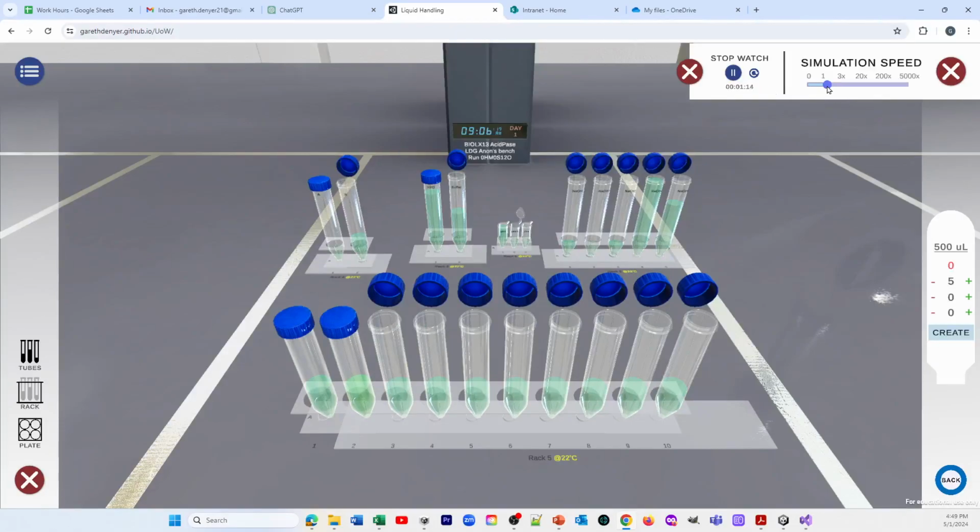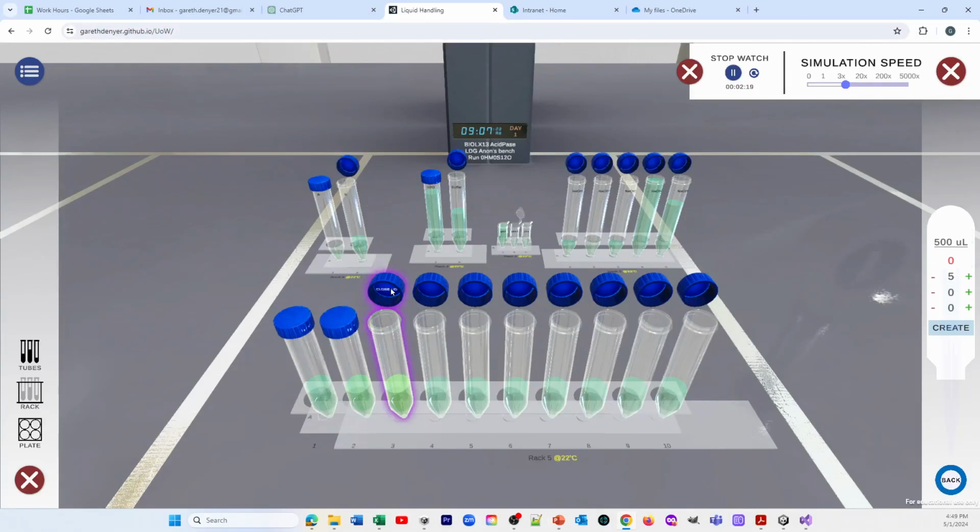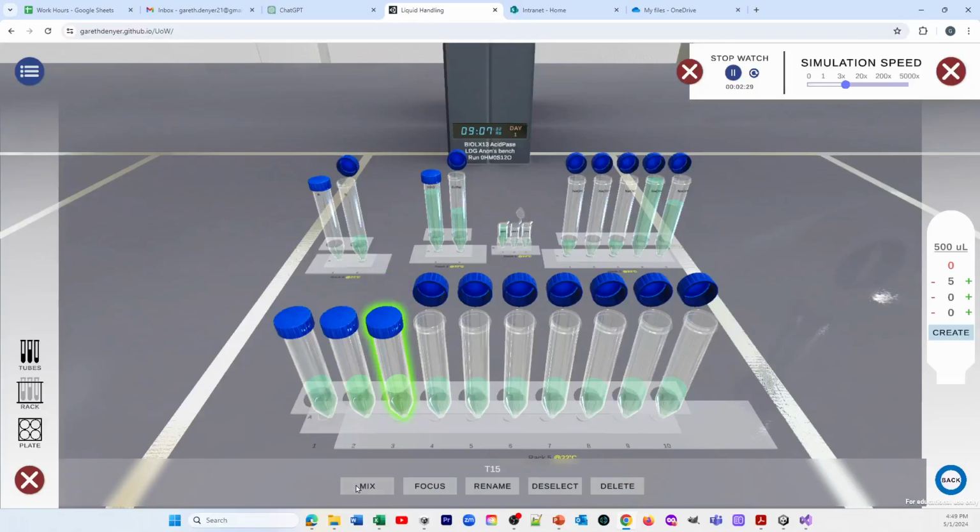So what I'm going to do is just increase the speed of the simulation a little. Let's make time tick over a bit faster. Now when I create the pipette and put it into here and suck up and pipette out, that was all a lot nicer. Now I can close the lid, mix it.